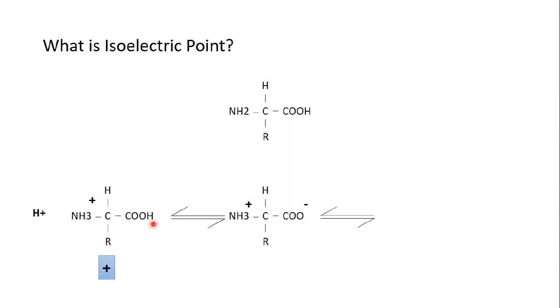The opposite happens when we have a higher pH, in which we have hydroxyl groups in the solution, and then both the amino and the carboxyl group will be deprotonated, and then the carboxyl group will be holding a negative charge, while the amino group will be holding no charge. So the amino acid in general will be holding a negative charge. This is what zwitterions means. So the amino acid can be both negatively or positively charged according to the pH of the solution.